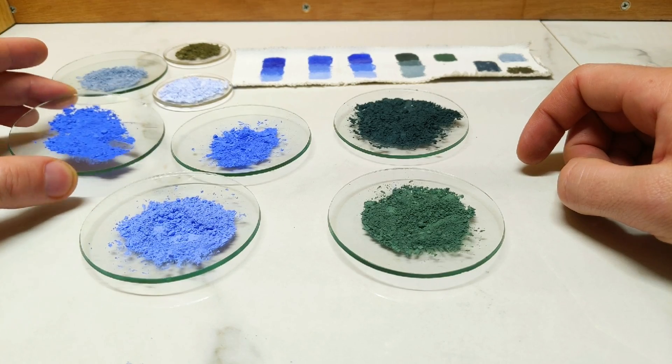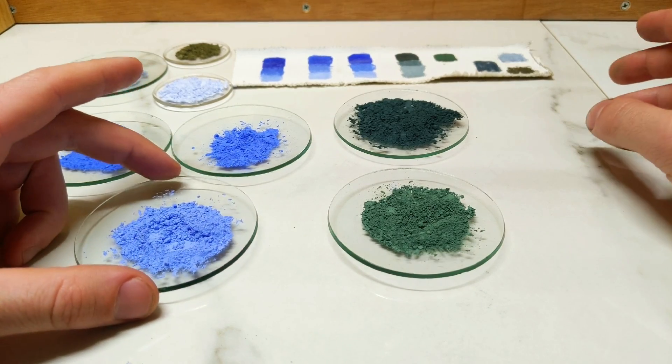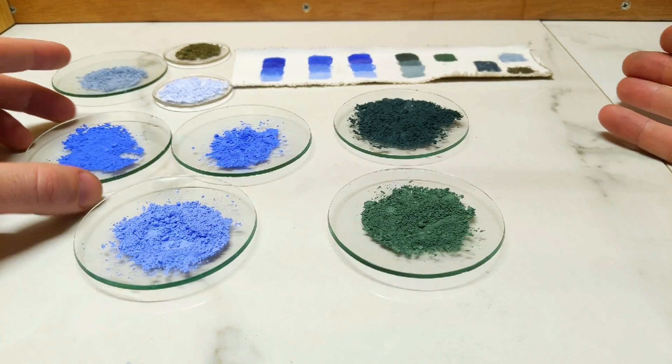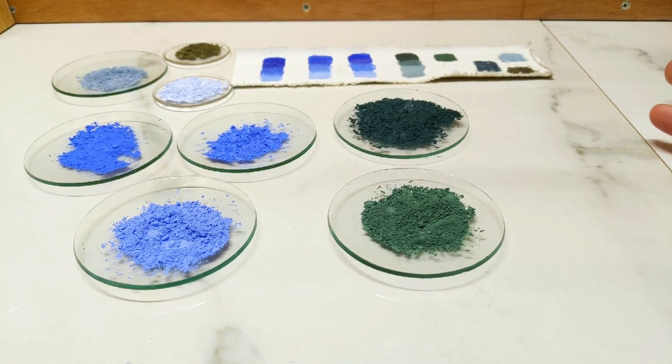There's a lot more I can do with this cobalt series — I'll keep refining it, working on getting turquoise and green results better, and I think I've got a process down for these darker deep blues. Let us know what you think in the comments. Any feedback on how the channel's going, improvements to my pigment-making process, or colours you'd like to see — please let me know down below.